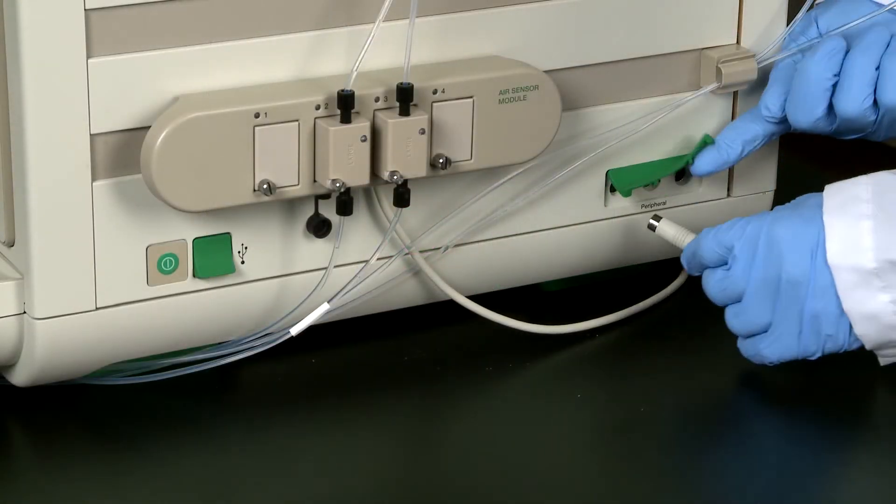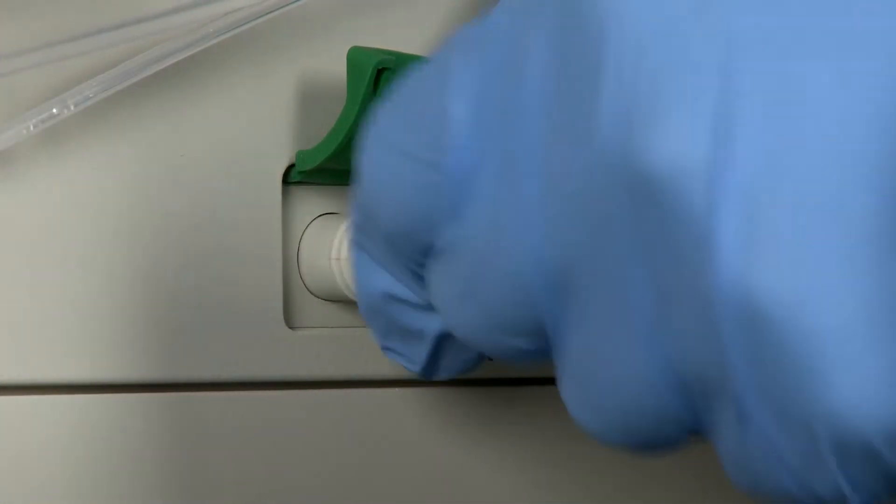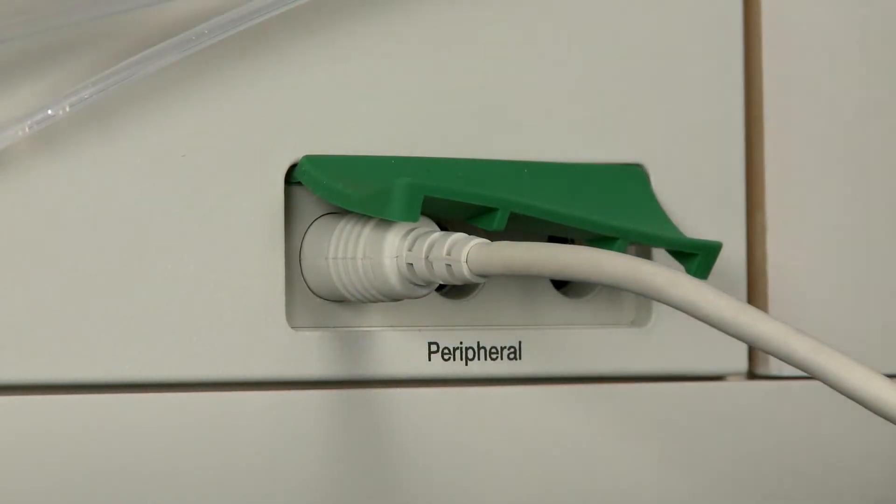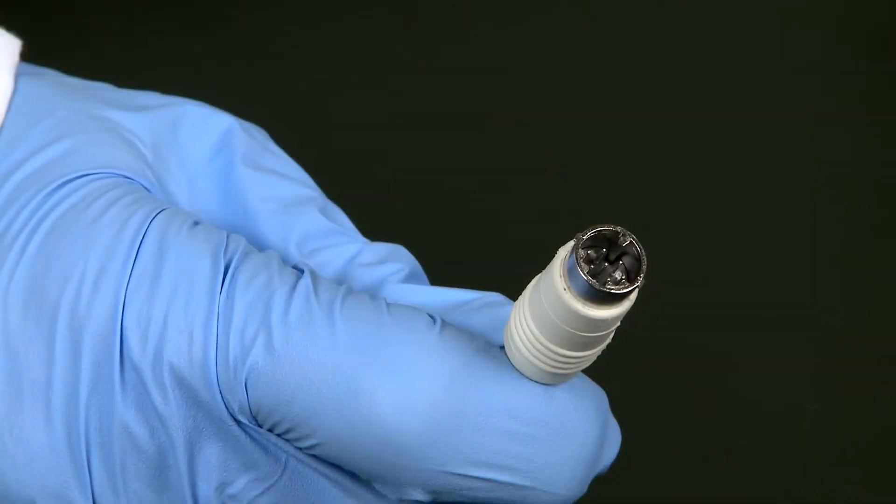Next, attach the air sensor module to one of the peripheral ports located on the side of the instrument using the 9-pin mini DIN plug.